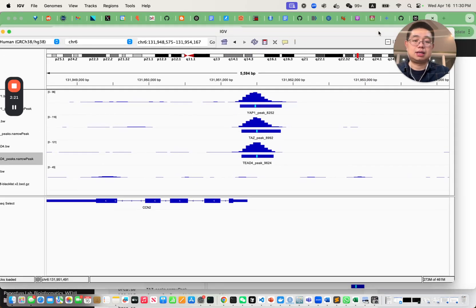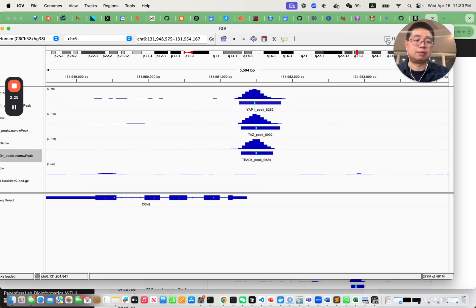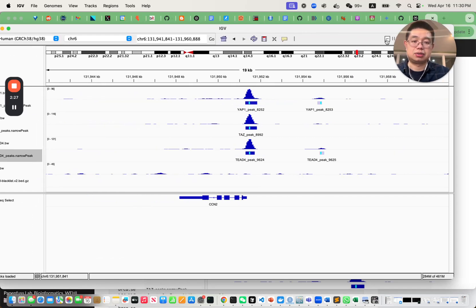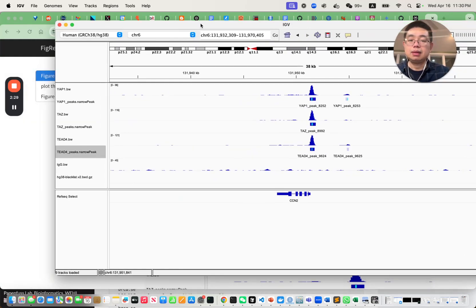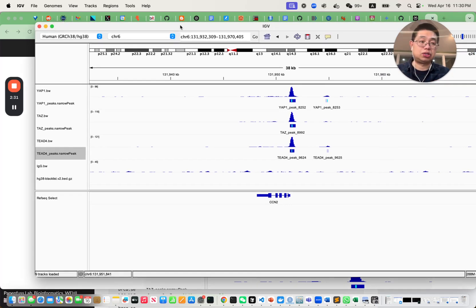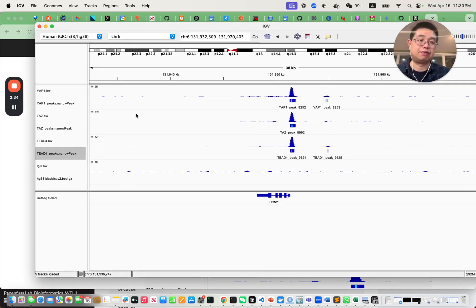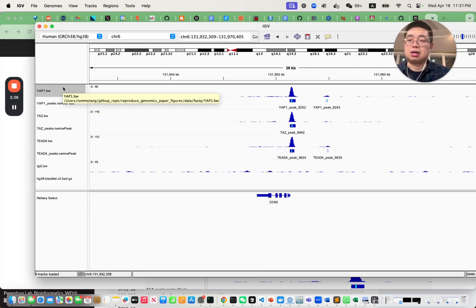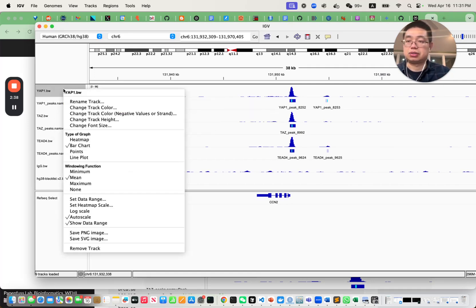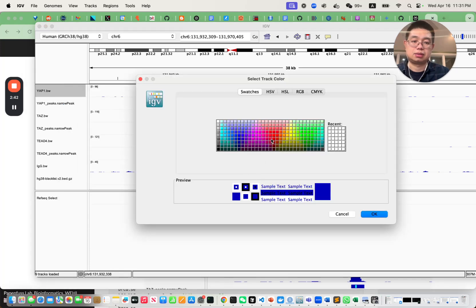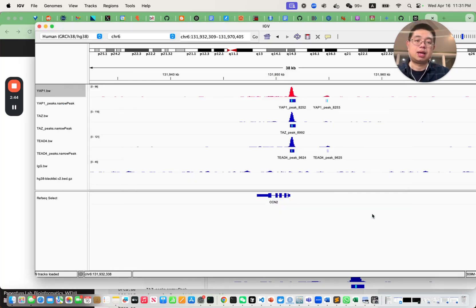As you can see, those three transcription factors have many overlapping binding regions. You can easily take a screenshot from IGV and make a figure. You can also change the colors — for example, change track color to red — and you can make a really nice figure just by using IGV.